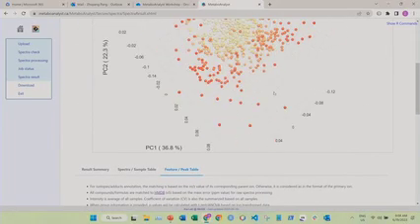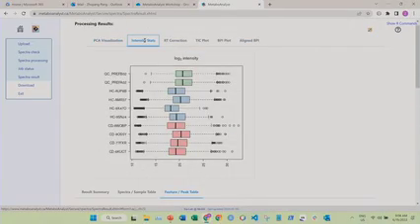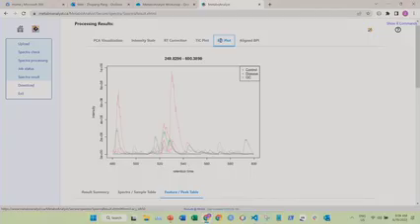After that, we can go back to the top to see the other results. This is the intensity stats for the different samples. This is also the retention time correction results, showing you the non-linear model works. And this is the TIC plot. This is the base peak ions plot. This is the aligned base peak plot. As you can see, compared to the unaligned results, the aligned one have aligned the variation of different samples.